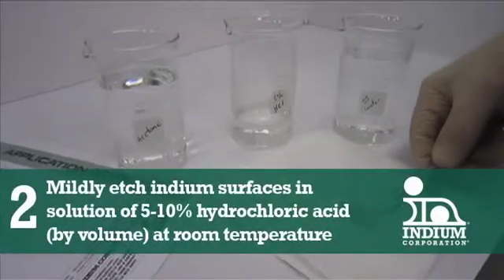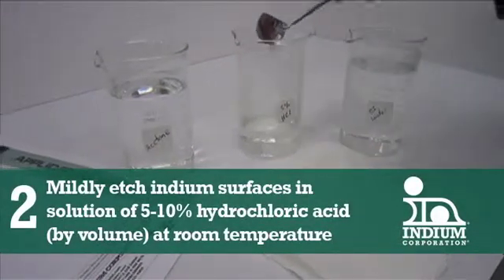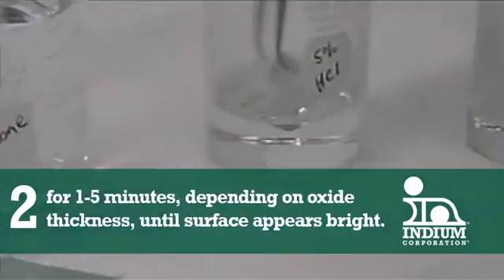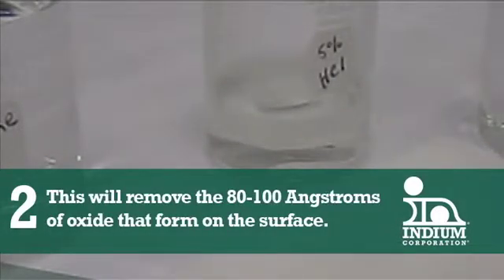Number two: mildly etch the indium surfaces in a solution of 5 to 10% hydrochloric acid by volume at room temperature for 1 to 5 minutes, until the surface appears bright. This will remove the 80 to 100 angstroms of oxide that form on the surface.